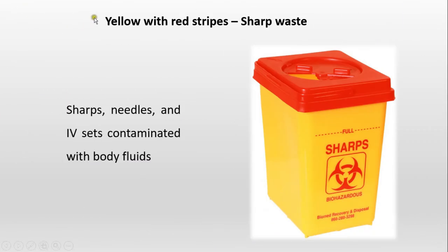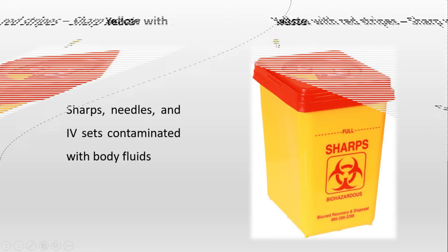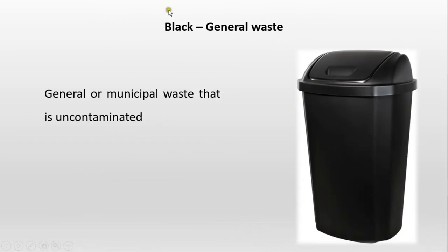Yellow with red stripes is used for sharp waste. Sharps, needles, and IV sets contaminated with body fluids are taken as sharp waste, and these should be disposed of into sharps bins. Black color code is for general waste — municipal waste that is uncontaminated is taken as general waste.